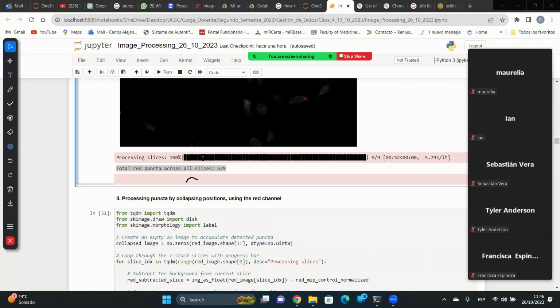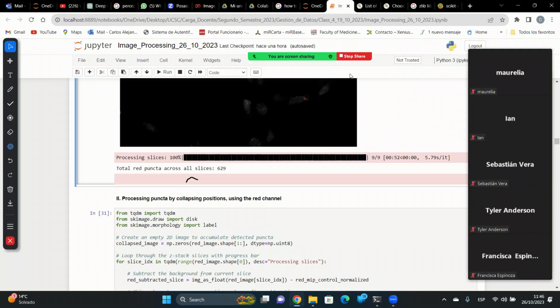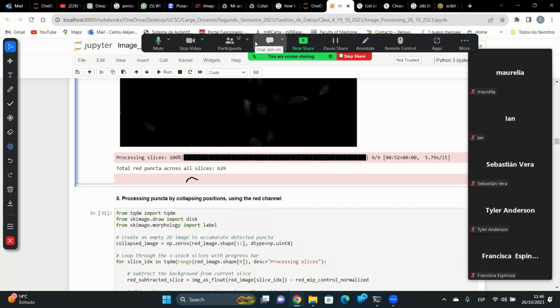But if you are working with tissues, for instance, if you want to quantify fluorescence signal from vibratome, it's called, correct me if I'm wrong, or cryostat, usually you don't need to collapse dots because the dots are contained in one z-stack. I don't know if I explain myself well or probably not. But if you want to share experience with that, doing imaging on vibratome or cryostat versus cell immunocytochemistry, please let me know.